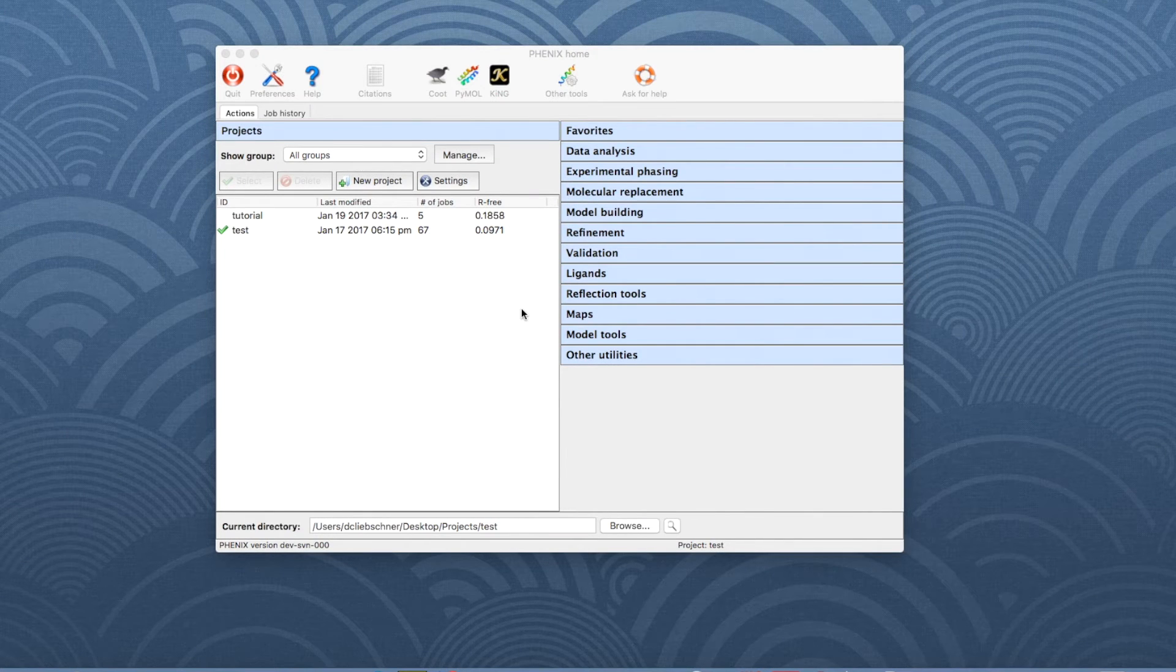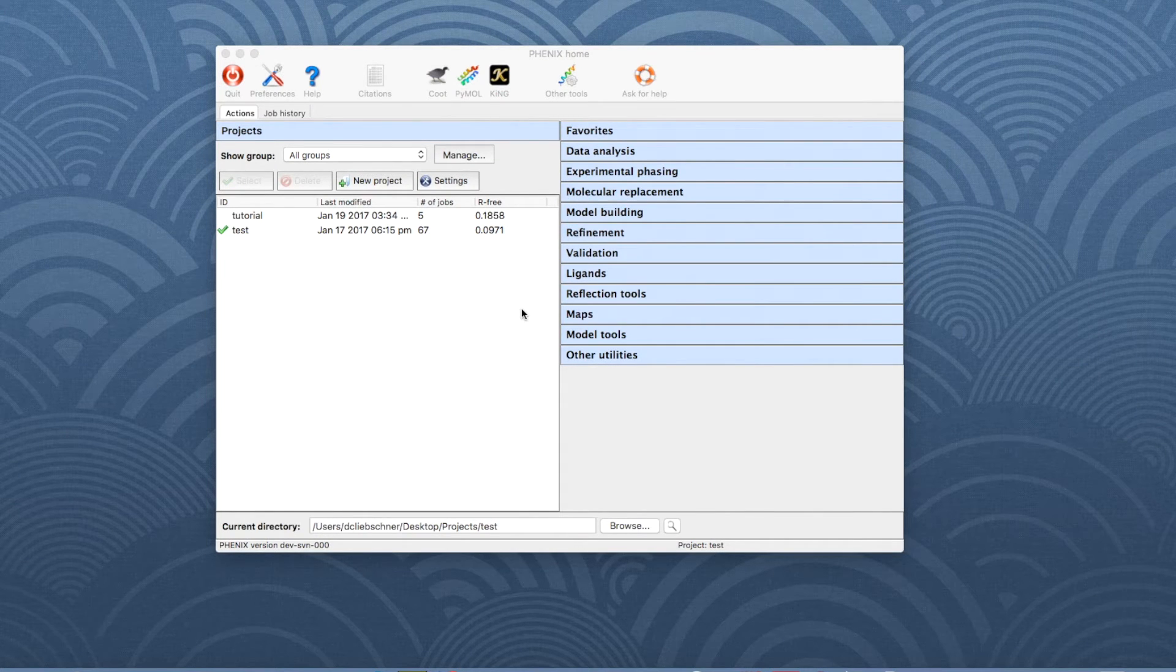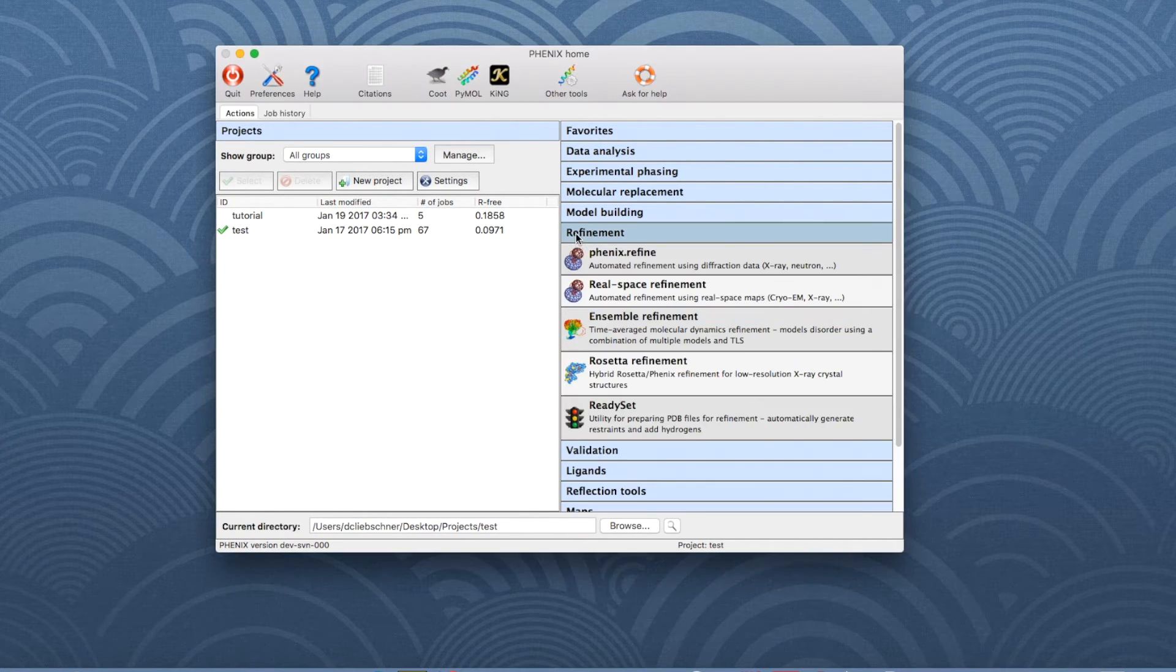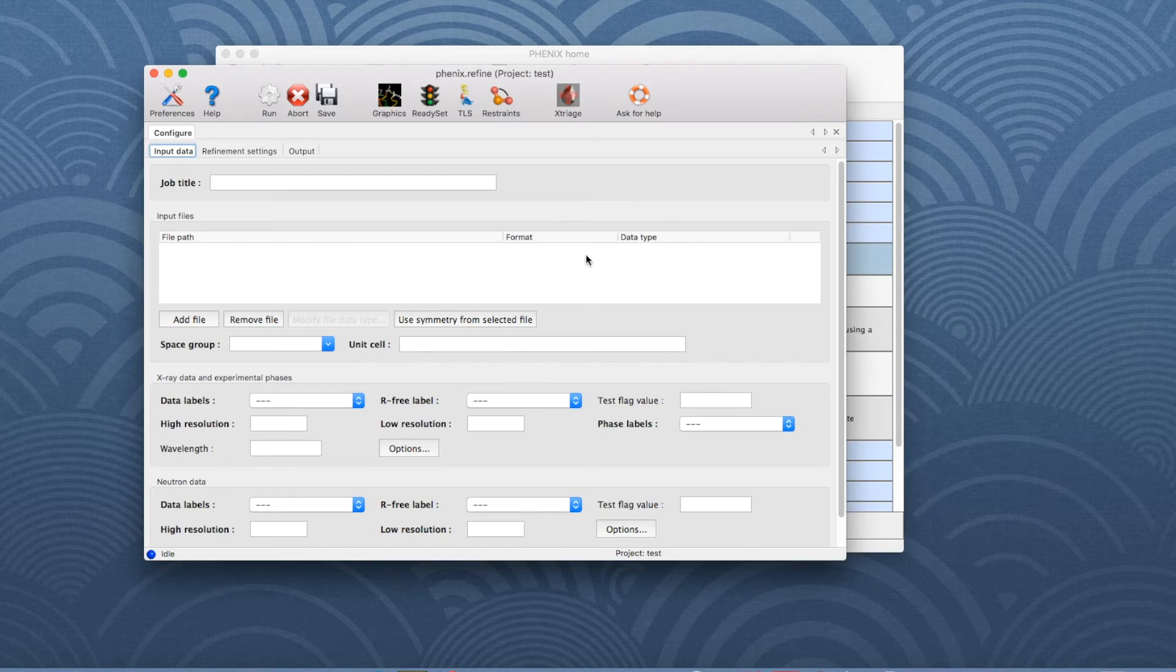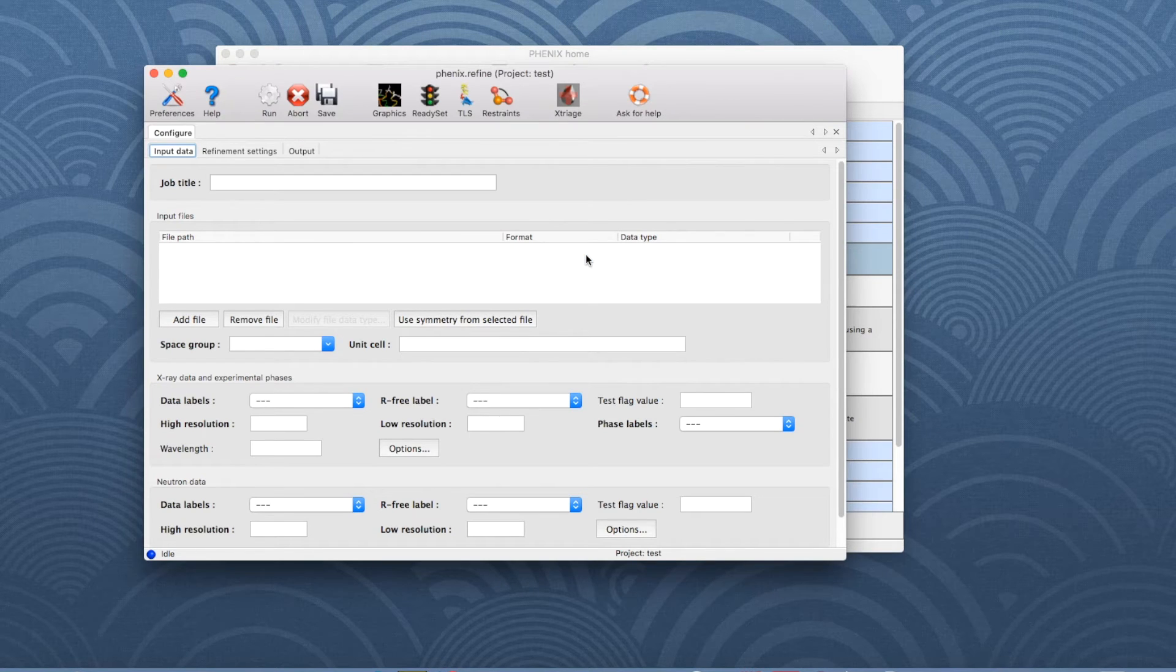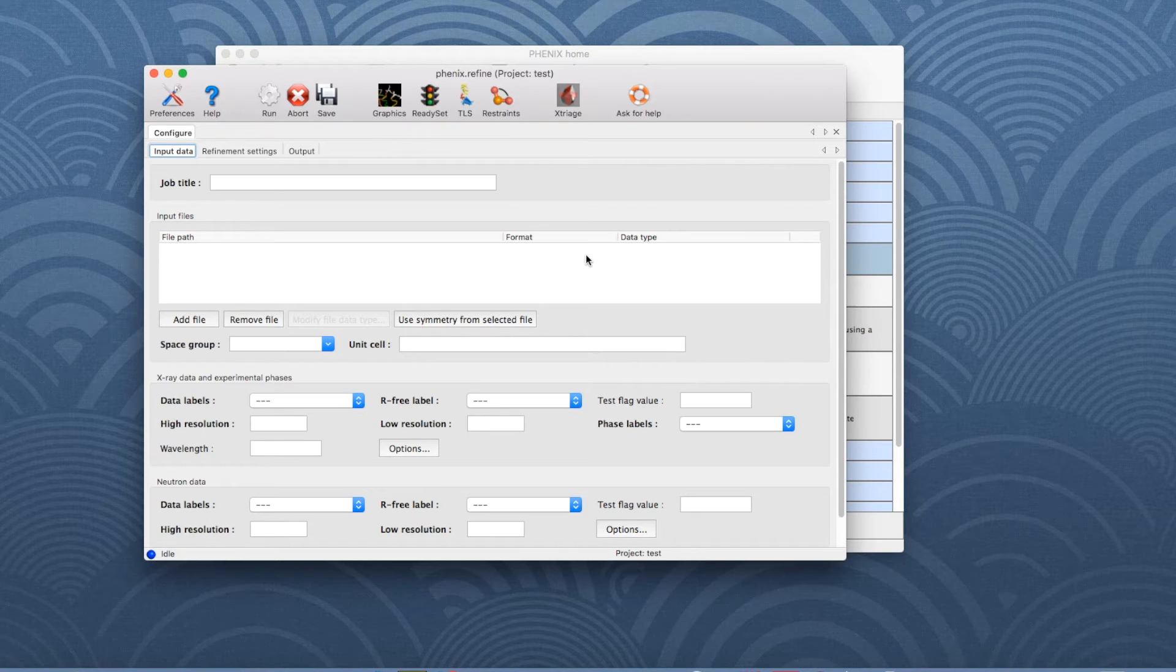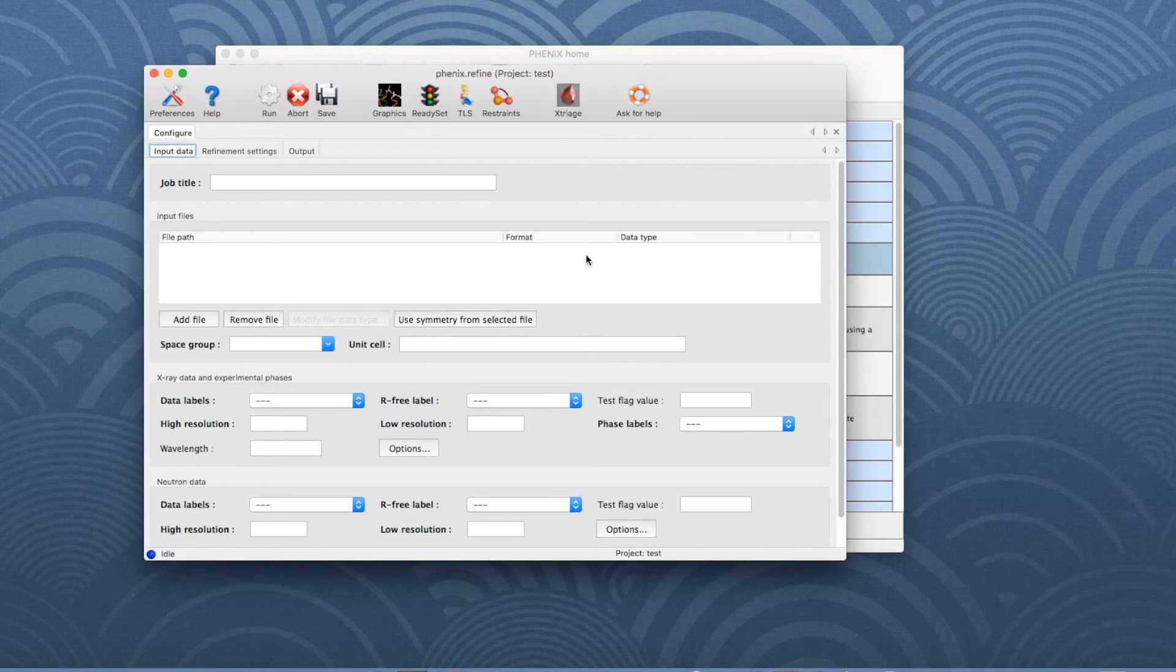Let's switch to the Phoenix GUI. In the right panel, open the Phoenix Refine window. Usually, the necessary files for refinement should be input first, but let's skip this step for our example.